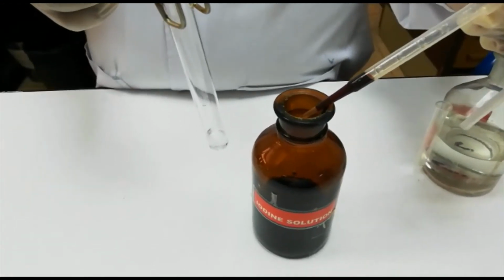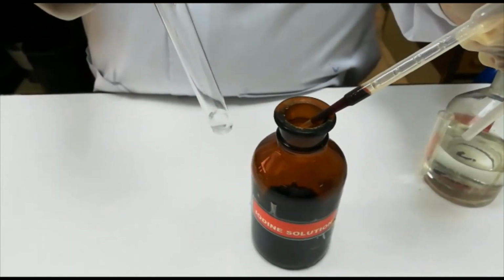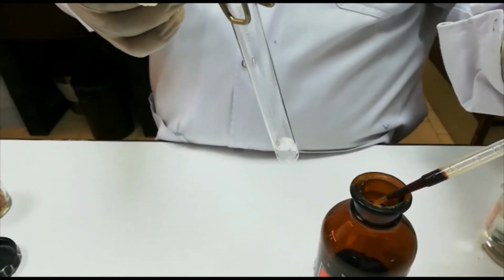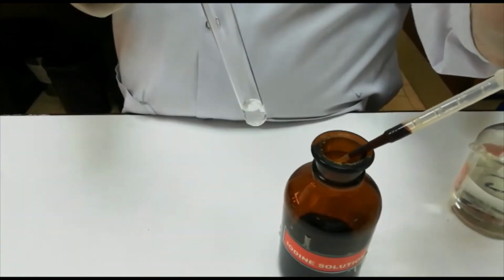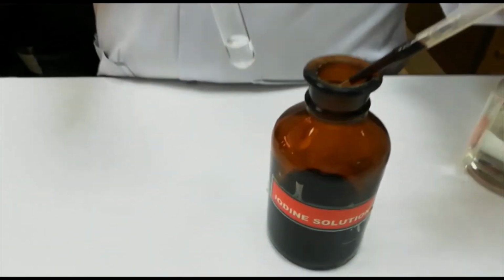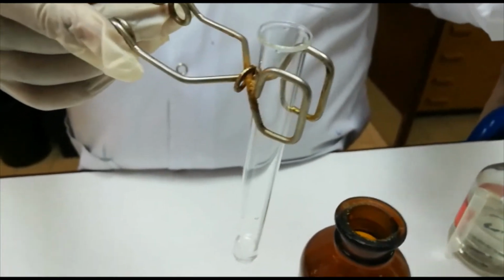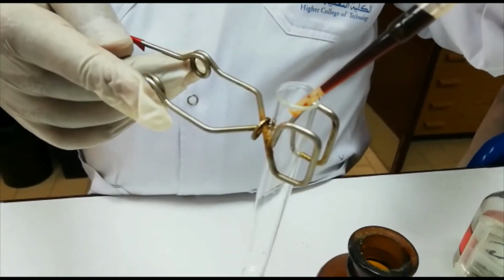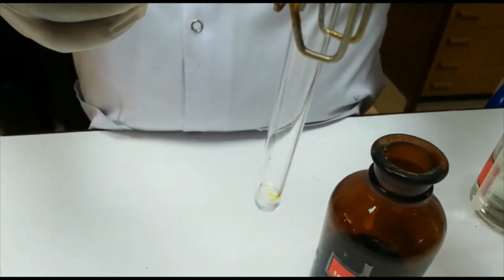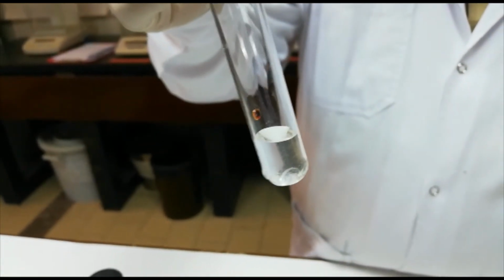Now we will have to see the confirmatory test for thiosulfate. Already the solution is there for thiosulfate, and one of the confirmatory tests for thiosulfate is that if we add iodine solution, the iodine solution will decolorize. You can see this brown solution. If I add 1 or 2 drops, you see that still it is a clear solution, the color is removed from the iodine. So this is the test for thiosulfate.